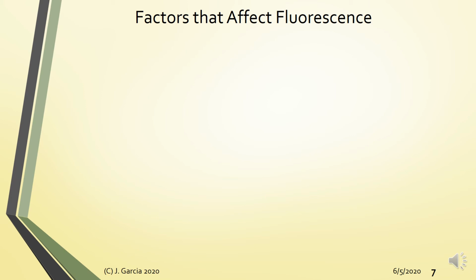However, even though it's the most sensitive technique available for spectroscopy, there is a limited number of molecules that could undergo fluorescence, or sufficient fluorescence to be detected.